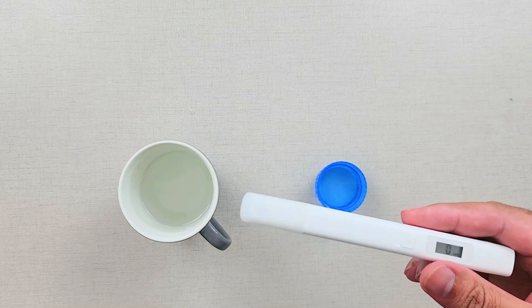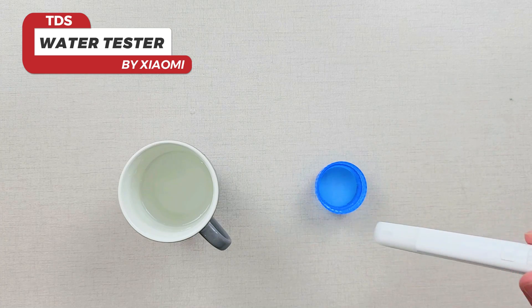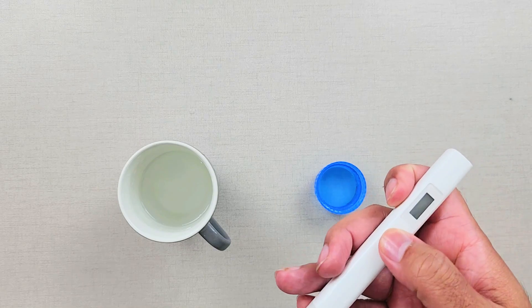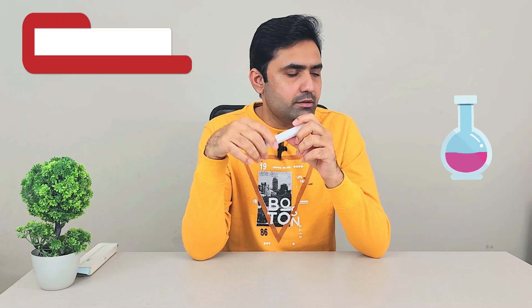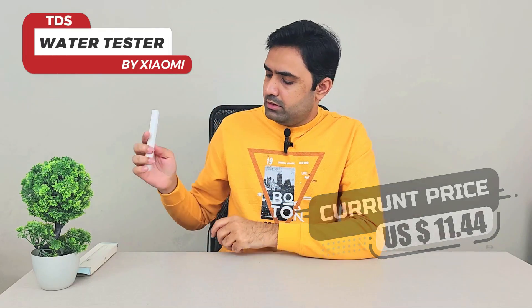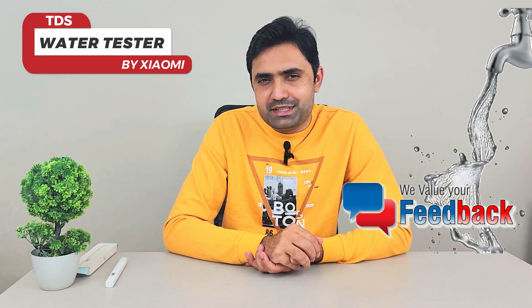You can easily test the value and it's really quick — the moment you put the probe in the water it gives you the reading right away, you don't have to wait. So this was our Xiaomi TDS water tester. I've been using it personally; it costs around 15 to 20 dollars. I'll leave the purchase link in the video description for anyone interested. Let me know if you're using something better and please share your feedback — take care of yourself!